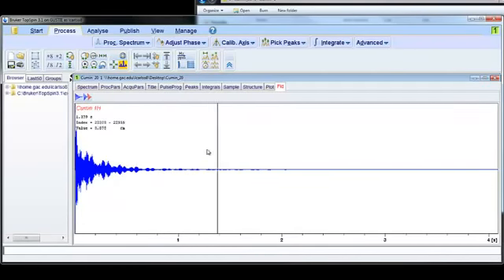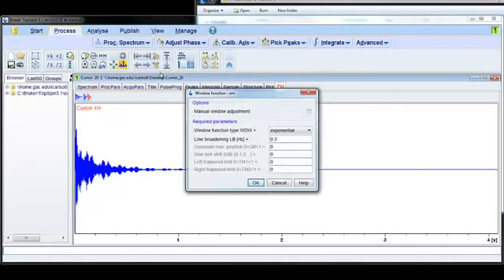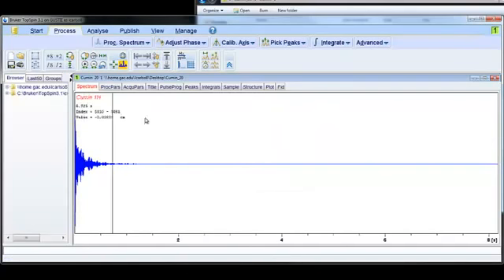And a lot of these points out here, these small little data points, are actually noise. They're not true signals from your sample. So in order to improve the signal-to-noise ratio, we can perform what's called exponential multiplication, which is a mathematical function that will truncate the data and improve your signal-to-noise ratio. So if I click on this down arrow under Process Spectrum and click Window Multiplication, this is already set up to do exponential multiplication. So I'll just click OK, and you can see that a lot of these points that were out here are now gone.